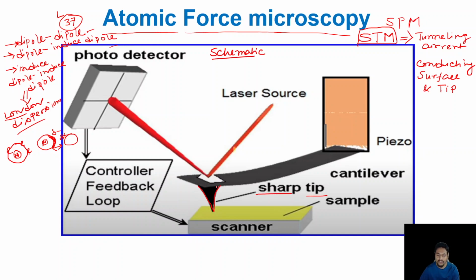And this sharp tip is not alone. It is actually embedded in a cantilever. This is the cantilever, right? And this cantilever is actually stuck onto a piezoelectric scanner, right? So what is a piezoelectric scanner?